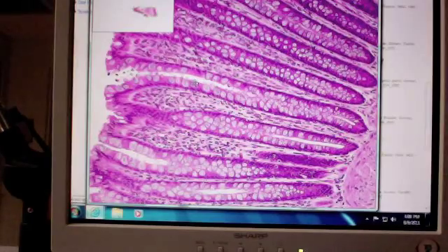All right. My pointer is sitting in the cytoplasm of what structure? This guy here, what is this? Goblet cell? Okay. Now, if I put an arrow going from the top here all the way down to the middle here, and I said, name this structure, if I want to be obscure, but what is the structure? Is it tubular? Simple, straight, tubular gland. All right? Four words that you have to remember: simple, it's straight, it's tubular, and it's a gland. Right? If I said name this gland, obviously simple, straight, tubular.